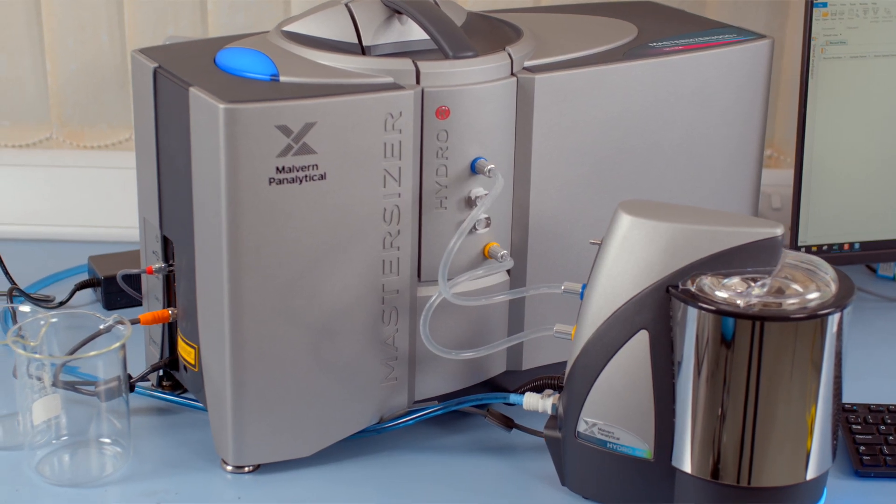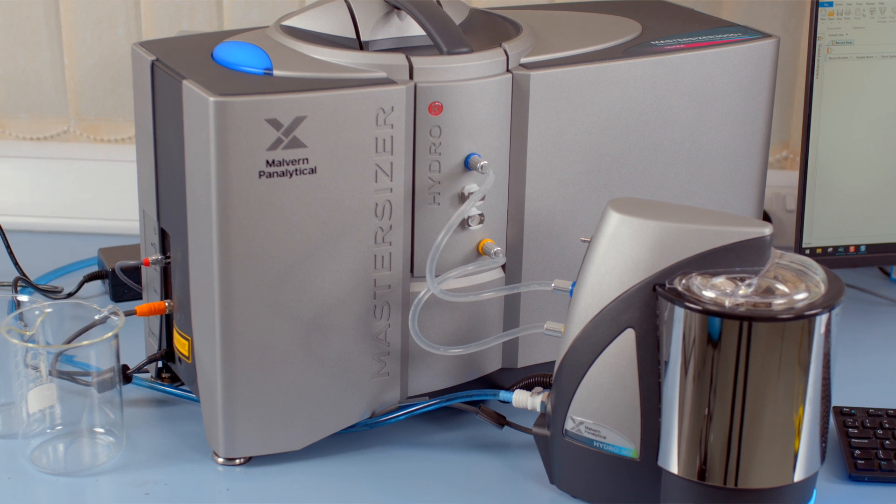Hi, I'm Ben, an Application Specialist at Malvern Panalytical, and today I'm going to be demonstrating SOP Architect on the Mastersizer 3000+, the latest development in laser diffraction technology for particle size analysis.